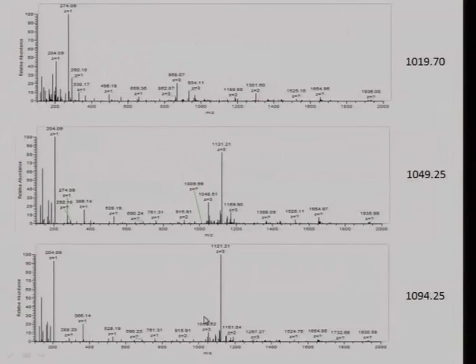So here's the first 3 spectra. Which ones of these do you think are differently glycosylated versions of the same peptide? Any ideas? Do you think this top one is a differently glycosylated version of the same peptide? Who says yes? I don't.